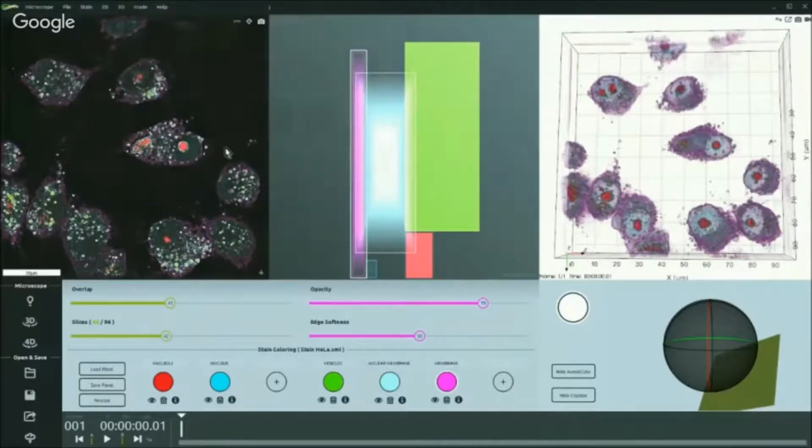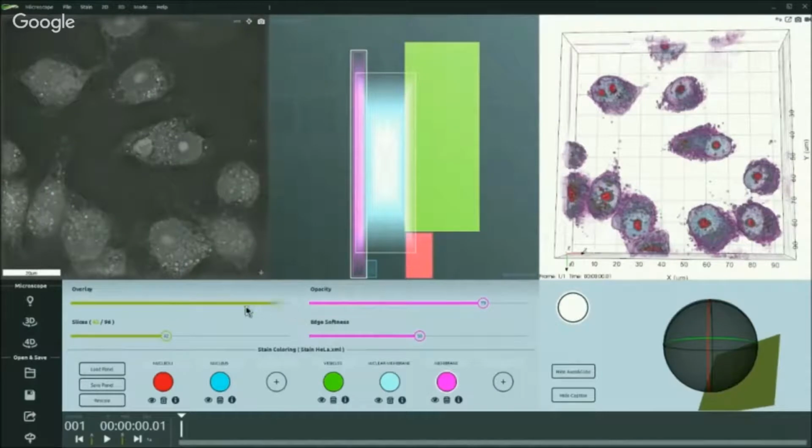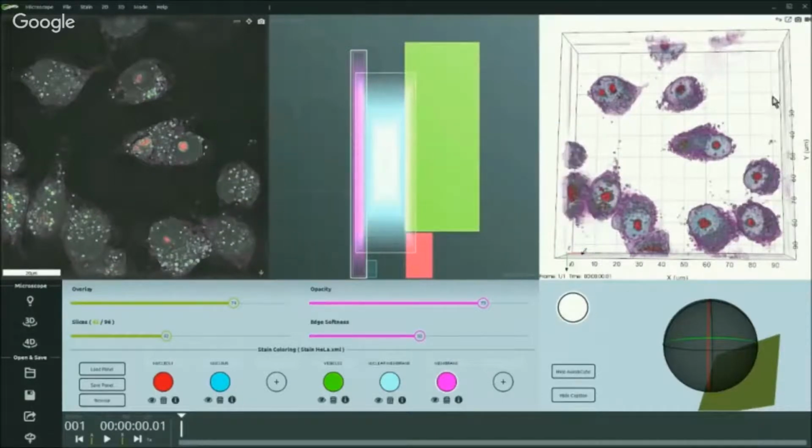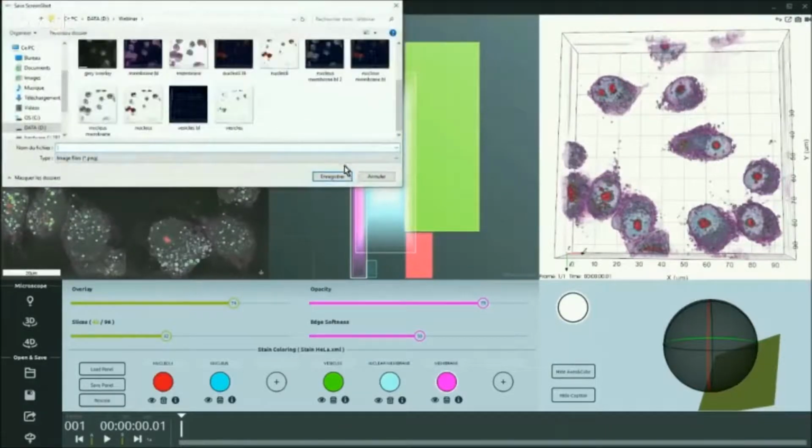Okay, now this is just a PNG, JPEG format, but of course you want to be able to export your data, so you don't do anything else than go here, activate this panel, and save 2-dimension, 3-dimension, and choose the type of format that you prefer. Okay, same thing, you can do it here with this panel. You can take pictures and shoot them out.